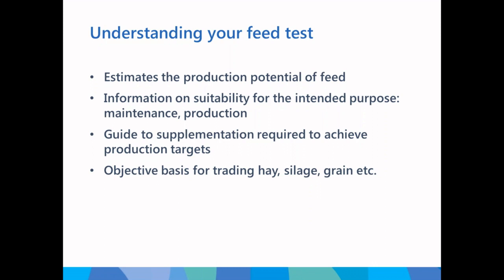The risk is that if somebody uses an NIR calibration which is developed on feeds which aren't common in Australia, or they're developed overseas and imported, they may or may not give you the same answer. I know anecdotally there are two labs in one state where one's known as the buying lab and one's a selling lab, because there's about a megajoule difference in the answers.